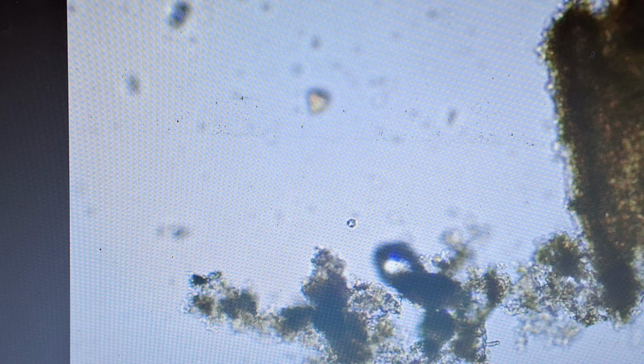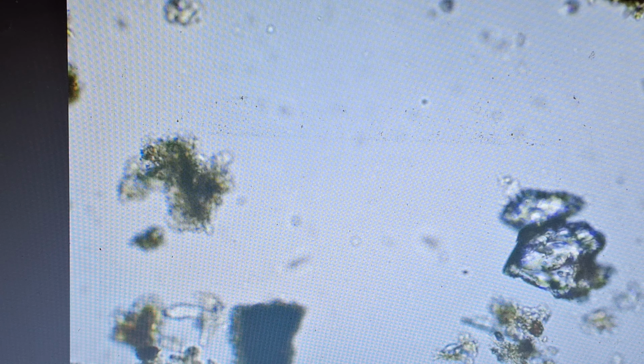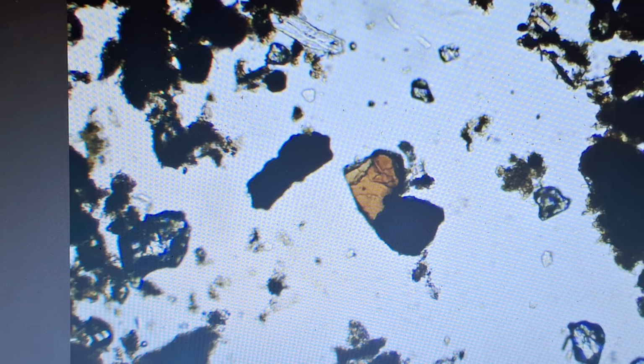It's a larger ciliate, I believe, there. But now we're going to back off to 40x. Let's hunt around a little bit, and we'll show you some of these large ciliates that are in here. I was talking earlier, there's a nice piece of humic acid. I found a whole bunch in here earlier.